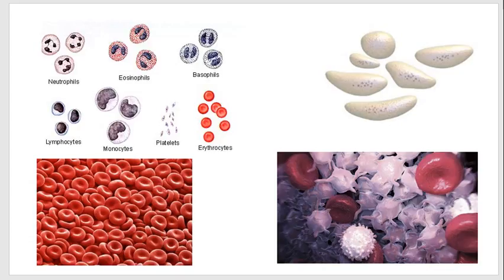Here we have another WBC picture and some SEM images, falsely colored, pseudo colored images. What is missing on this slide is references, if we have taken these images from some website or something.